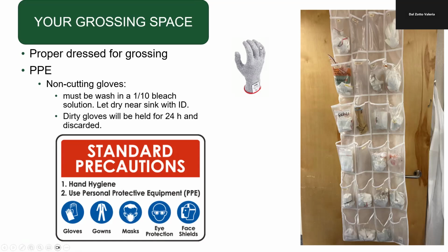On the first year of residency, you're going to receive your non-cutting gloves. Non-cutting gloves can sometimes become dirty, because you're going to put your latex gloves on top of the non-cutting gloves. So sometimes the latex gloves have holes, or during manipulation of the specimens can break, and fluids and blood can stain the non-cutting gloves. These gloves must be washed in a 1:10 bleach solution and let dry near the sink with your ID, with your name.